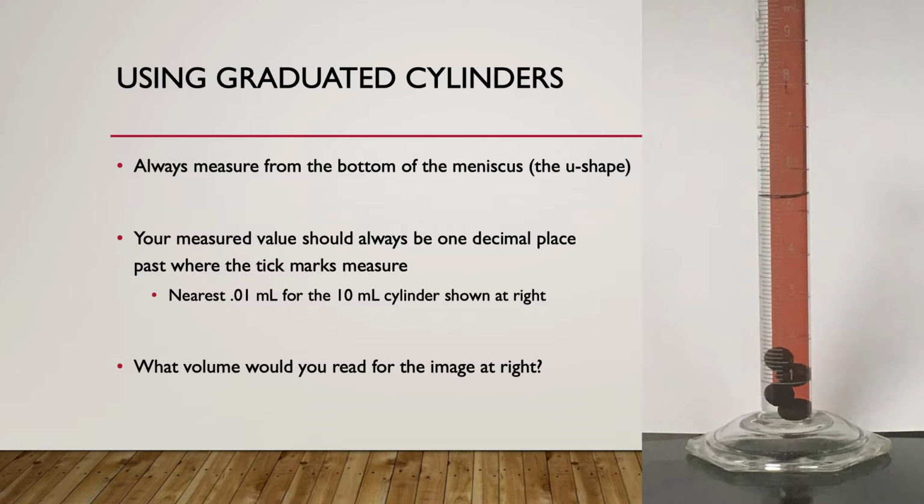The way we're going to measure volume for samples A through E, which, by the way, for the mass part A through E and the volume part A through E, those samples should be the same, so don't change anything about them when you're going from one to the other after you've gotten mass, and then you go to measure the volume of each of those samples.